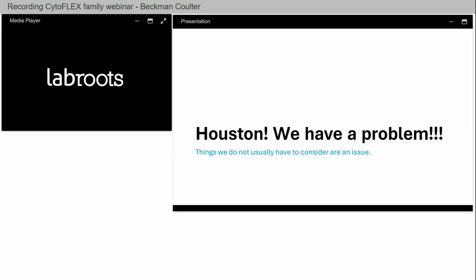We're moving down that threshold, looking at the bottom of the limit of detection. We really want to see where our signal to noise ratios are, what we can actually process.